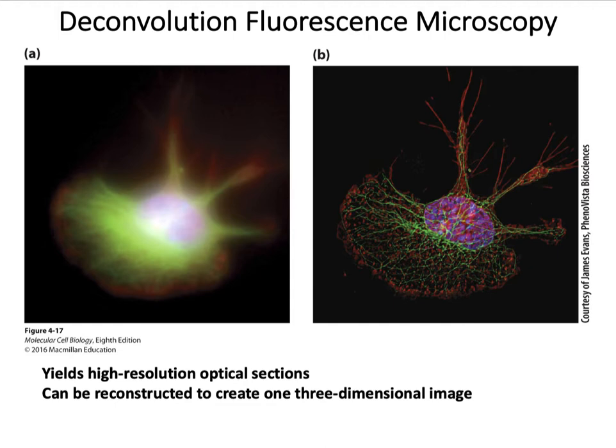However small it is, it could be 5 micron thick, which is literally a slice through a plane of a single cell, but there is a thickness at the microscopic level. Now, let's say you took that 5 micron slice of the cell, fixed and labeled the sample with fluorophores, and observed it with conventional fluorescence microscopy. Remember that the sample is 5 micron thick. You focused your microscope precisely at the 3 micron plane of the 5 micron thick sample.